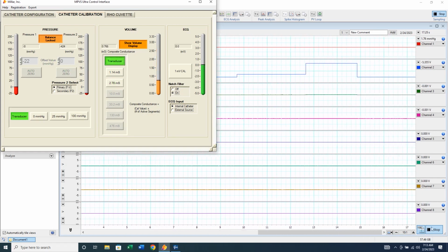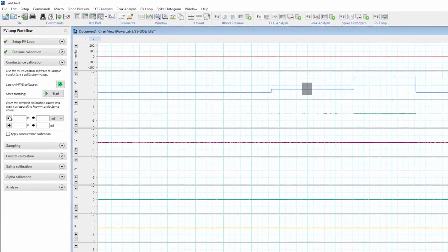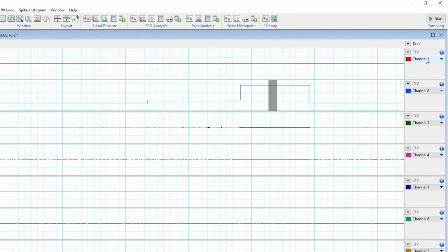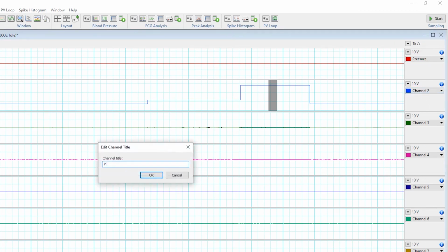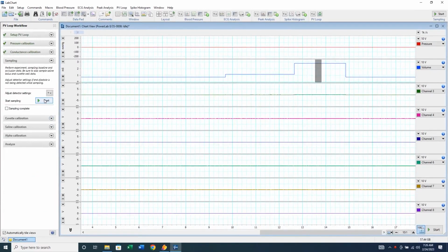Back in LabChart, stop the recording and this time select the step changes in the volume channel corresponding to the 2 conductance values and fill them into the calibration boxes as shown. Now click Apply Conductance Calibration. Additionally, one can rename the channels by right-clicking on the channel name, and then renaming the channel, as shown here. The system is now ready to start recording PV data.